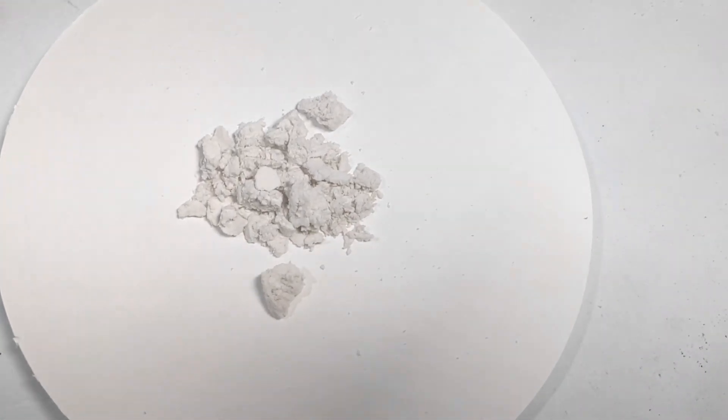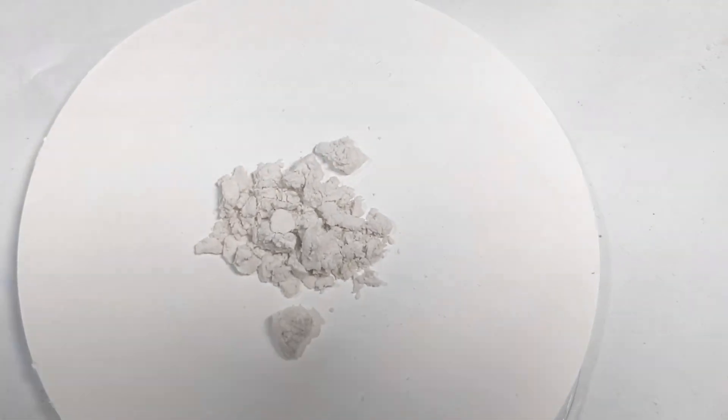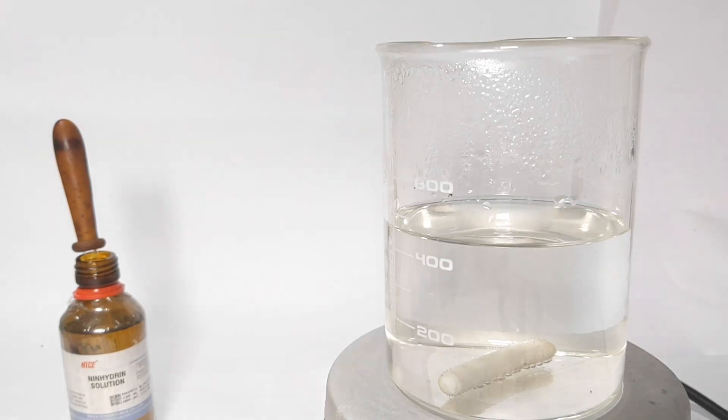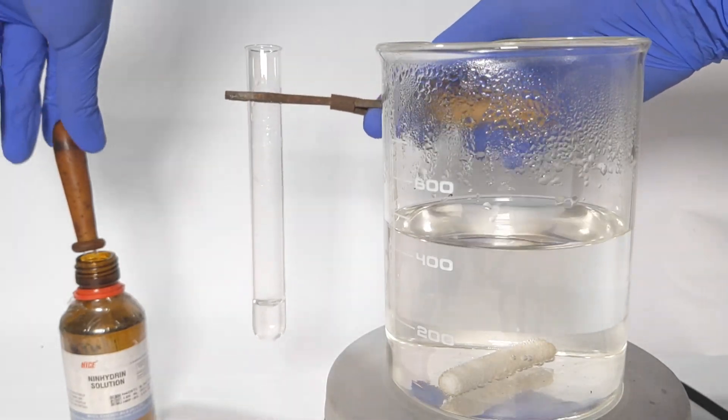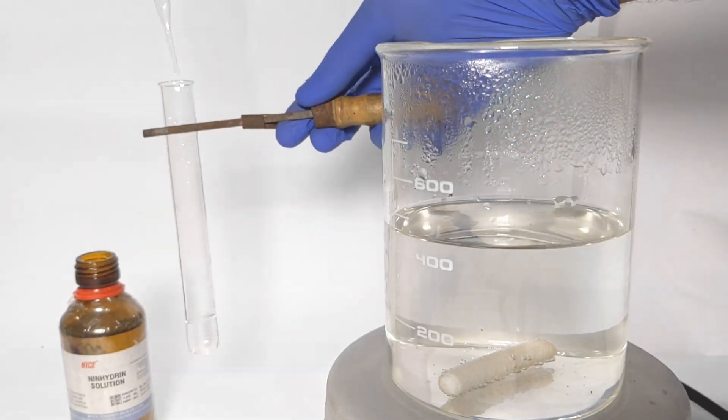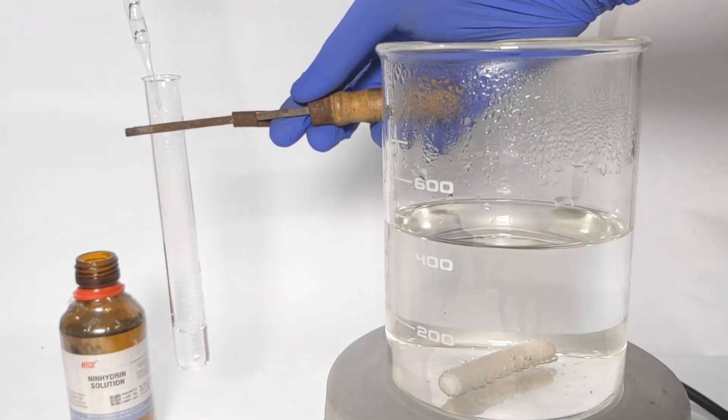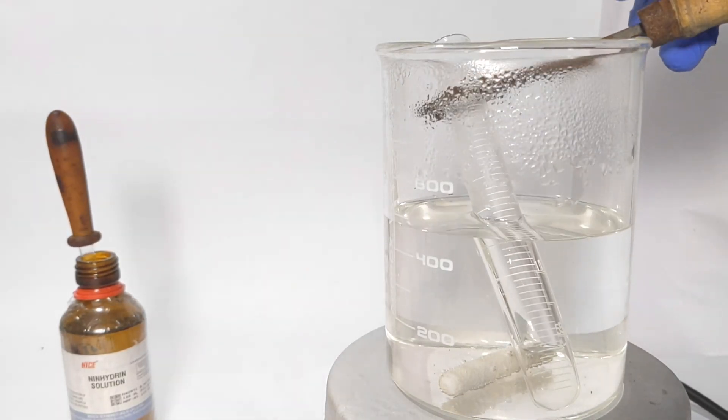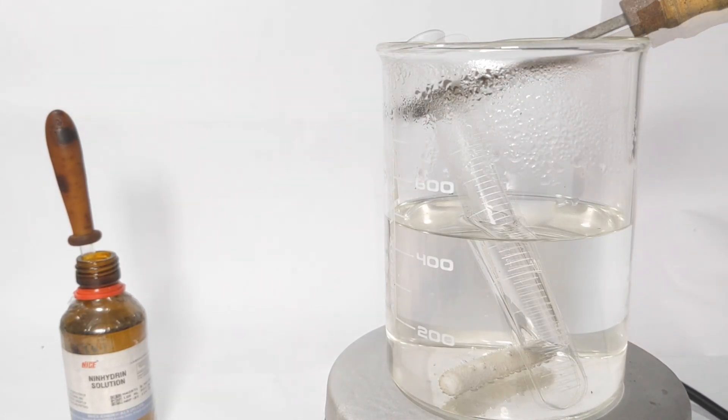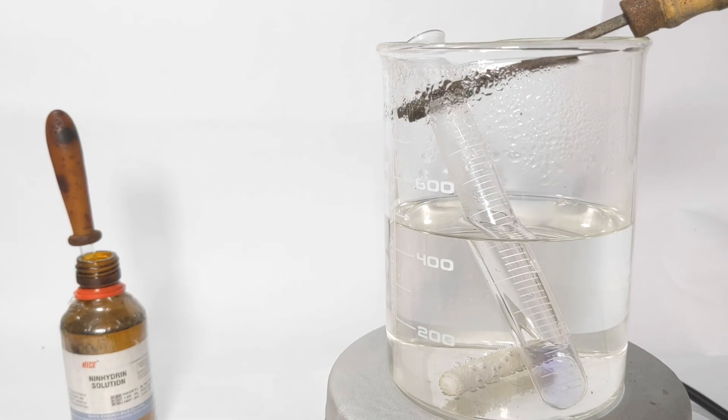I then did the ninhydrin test to confirm the presence of alpha amino acids. To a 2 percent solution of glycine, a few drops of ninhydrin reagent was added and the test tube was placed in a hot boiling water bath for a few minutes. A purple color was obtained which confirms the presence of alpha amino acid glycine.